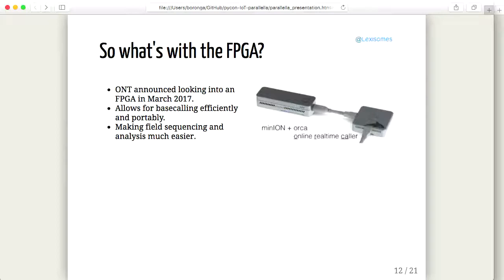So they scrapped that and said, you guys have to do the base calling yourselves, and they provided a CPU-based algorithm to do so. There are also a few open source algorithms that I'd recommend if you're interested in going through and contributing to. For us, where we've got one MinION and a whole bunch of HPCs, this was okay, because we could, in real time, take the data off the MinION and run it through our HPCs. A few of my bioinformatic colleagues might get a bit annoyed because they're wondering who's submitting all these jobs, but nonetheless it was doable, though obviously not portable.